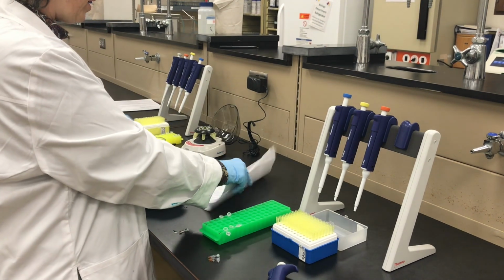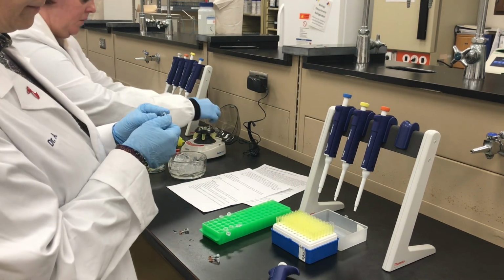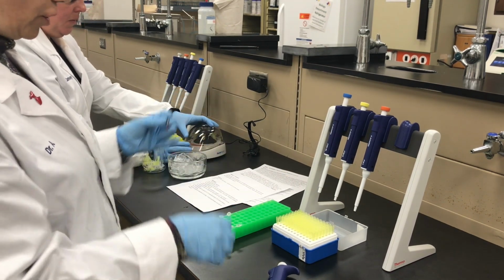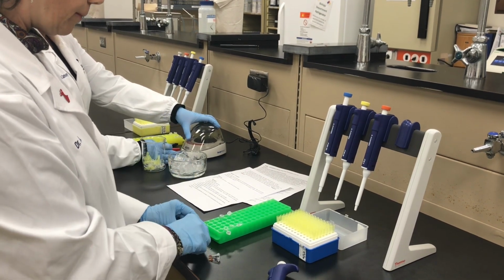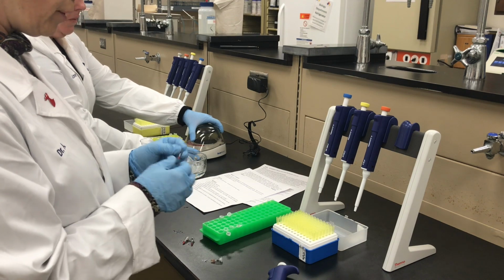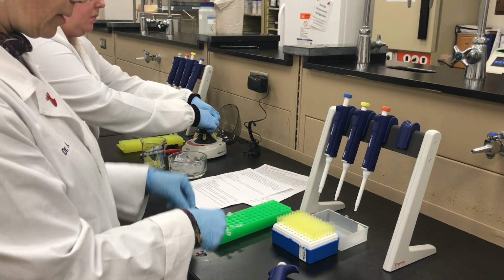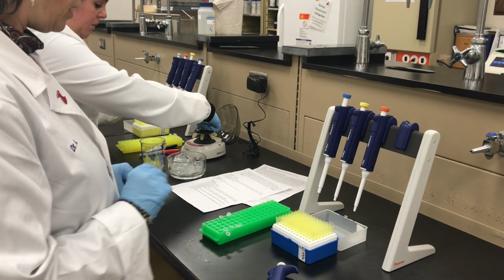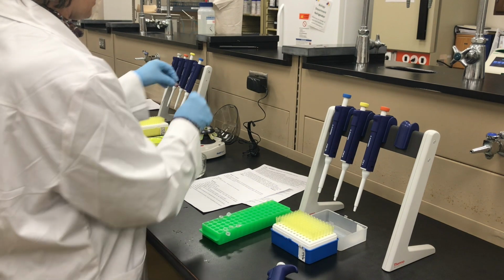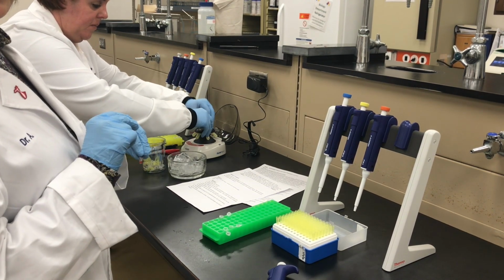Page, flip and spin, I do believe. Your protocol says it should be green. They changed colors on us. Now it should be orange. Okay. So Dr. Cheney spun hers down. I'm going to spin mine down. Then we're going to walk over and put them in the PCR machine.